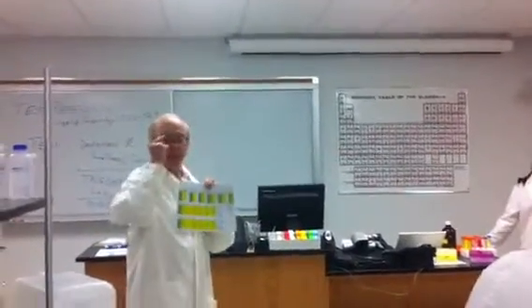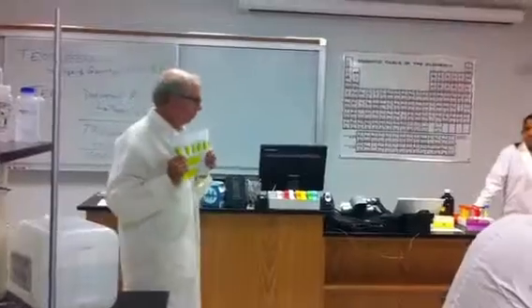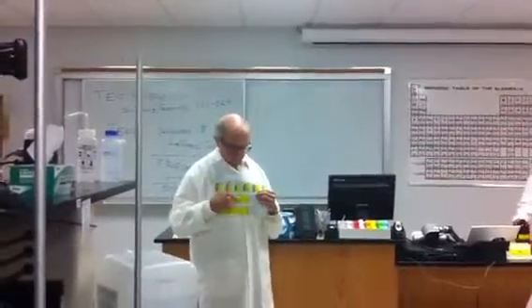Now, very frequently, through no fault of your own, because you are working with very high error since you have no temperature control in the lab, you may inadvertently have one that reads more color than it should have. In other words, it gets out of sequence. It might give you more color than it should, when it was supposed to go downhill.